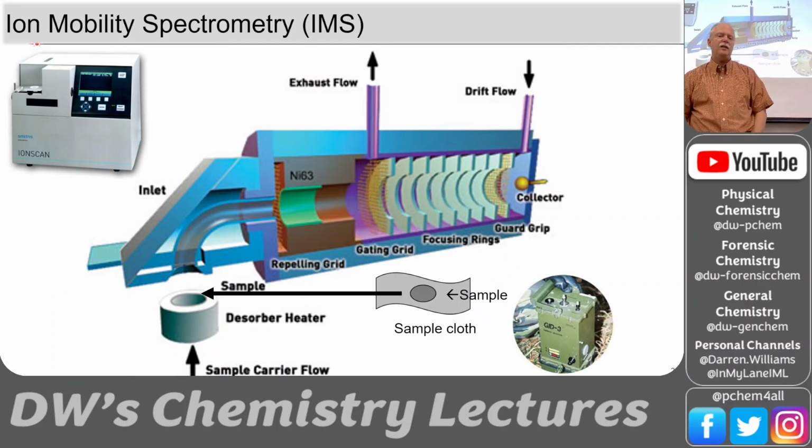Then we have ion mobility spectroscopy, which is on slide 9:15, but let me just run through it real quick. Okay, there's nothing really tricky about this. It's kind of like mass spec, but it's mobility. It's not mass spec, it's ion mobility.